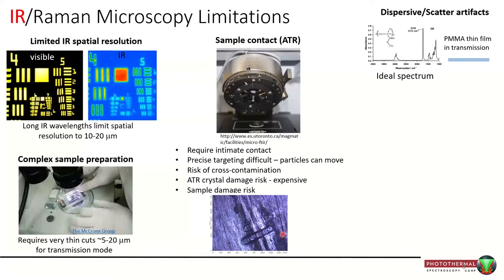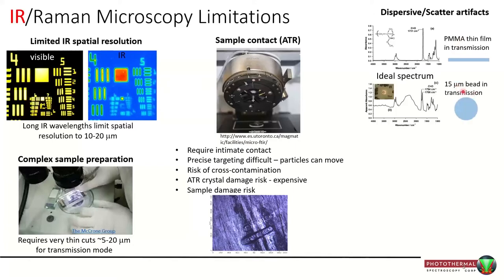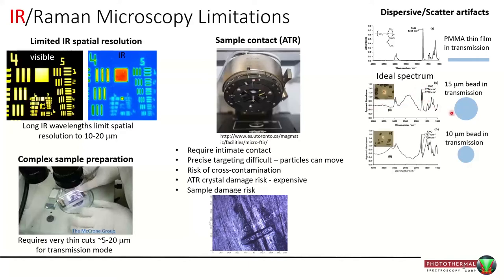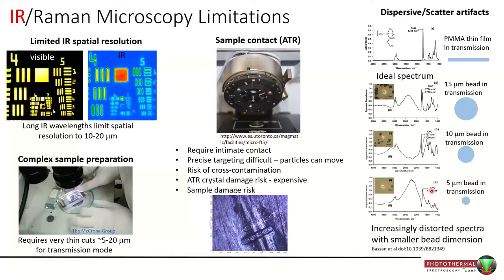Perhaps one of the biggest and lesser-understood issues are what we call dispersive scatter artifacts. Starting with an ideal thin film measurement in transmission mode, you get a nice flat baseline and symmetric peaks — this is the spectrum of polymethyl methacrylate. But if you take the exact same material as a sphere and measure it in transmission mode, the spectrum looks very different: offset baseline, split and shifted peaks. This effect is size-dependent, making identification difficult because spectra are now dependent on sample shape, size, and surface roughness.